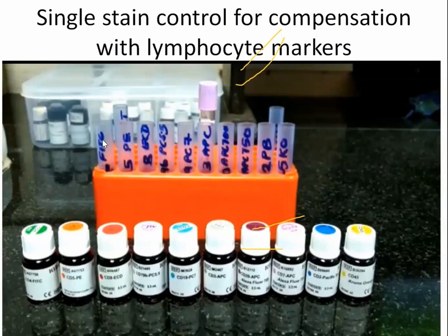So in the first tube, it's a FITC control, right? So I'll add only the FITC fluorochrome into this. Then I will acquire this particular tube in the machine. I'll see whether signal is coming in other channels except FITC. If there is signal in any channel other than FITC, it means it's spilling over. Then I need to do auto compensation to correct it. Then I need to run the PE tube.